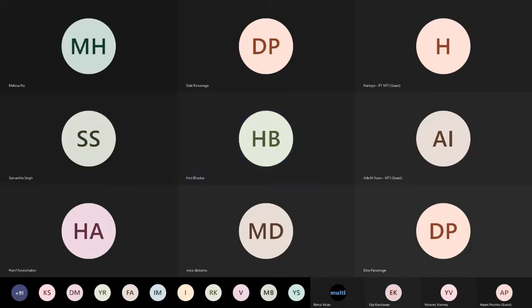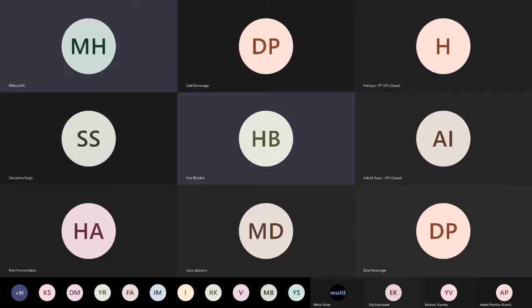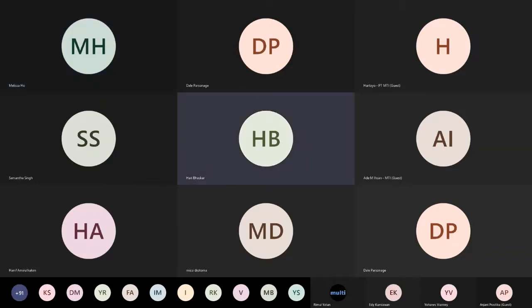This one is a question pertaining to how do we use monitor samples? We currently have it, but we don't know how to use it. Okay, that's actually a good question, an interesting one. So the whole purpose of a monitor sample is to do an instrument drift correction. So what does that mean?